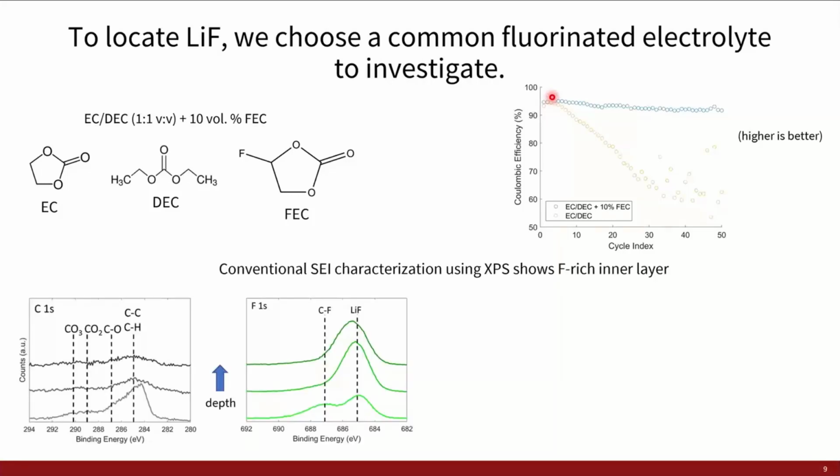If we take lithium metal plated within this electrolyte, take it apart for standard ex situ XPS characterization, the same way everyone in the field does it, and start to depth profile, what we see is that the SEI structure looks a lot like what we would expect, and has been reported in the literature. Basically, there's an outer, more organic layer consisting of organic fluorines along with various carbonaceous materials, and by depth profiling deeper, we can see an increase in the lithium fluoride signal. So the SEI is getting more inorganic.